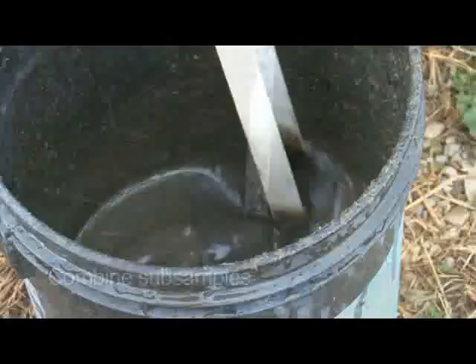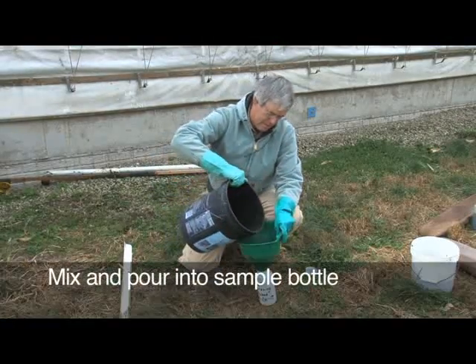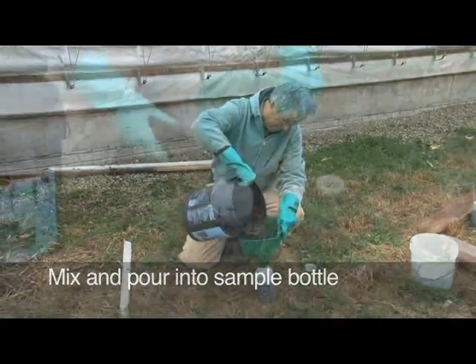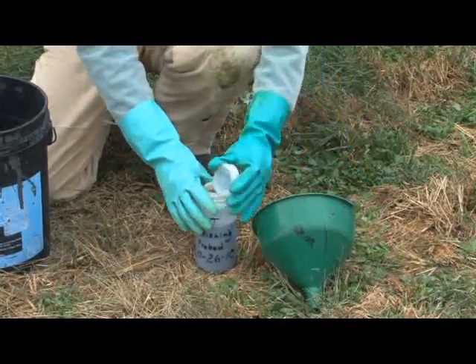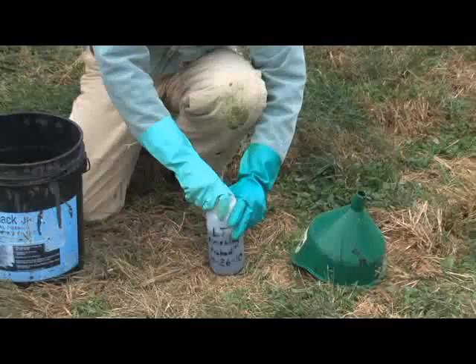After samples are collected, stir or swirl the bucket around to mix the subsamples. Next, using the funnel, pour the mixed sample into the labeled bottle until the bottle is about 3/4 full. The sample may be frozen before sending to the lab, so the extra space is needed for expansion. The sample should be frozen immediately and shipped frozen on a Monday or Tuesday, so it arrives at the lab for analysis during the week and not during the weekend.